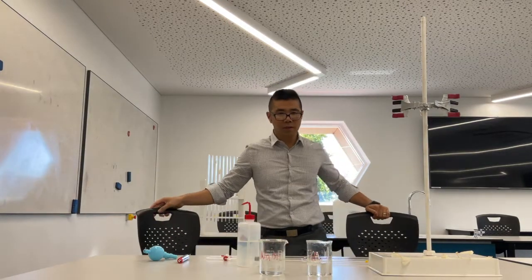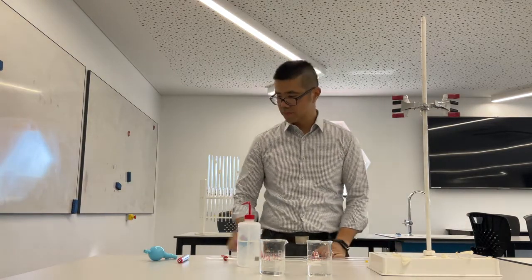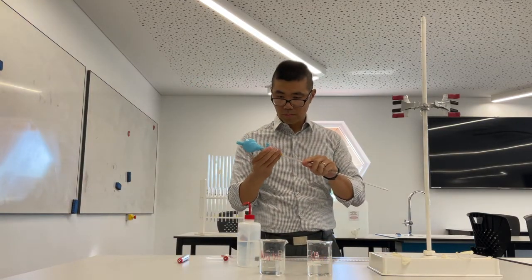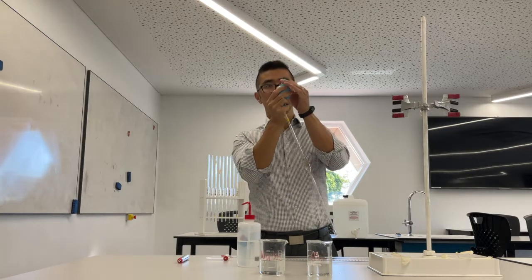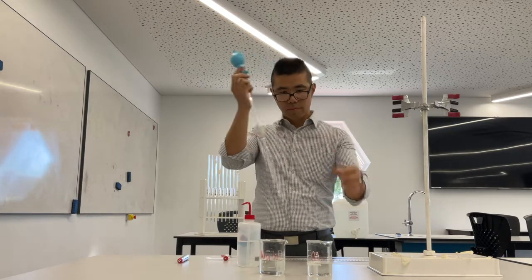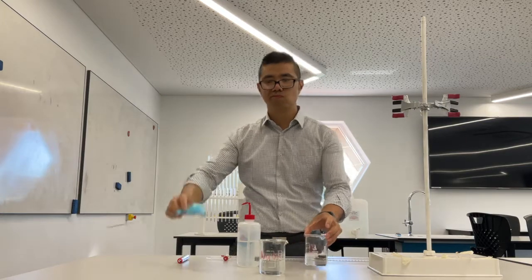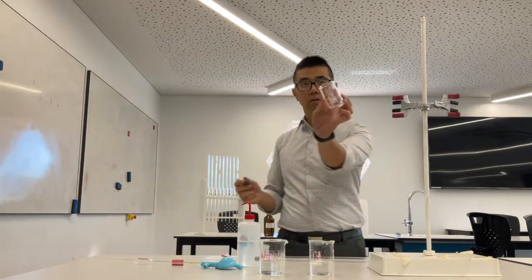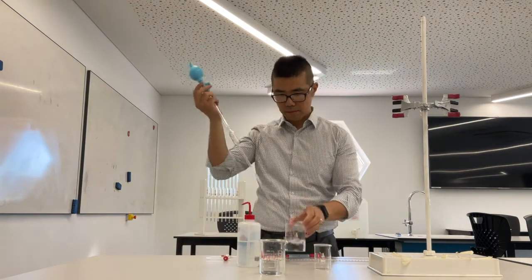I'm thinking about what goes into the burette and what goes into the pipette. Take the pipette bulb filler, put the pipette in. The idea is that you're not putting too much of the glass part into the end of the pipette filler. At the top there is an A button, and you press and hold that A button whilst you squeeze the bulb — it releases the air out so that it can suck. There is also an S button on the pipette filler. I realized I needed a waste beaker, so I got one, because I'm about to clean the pipette.